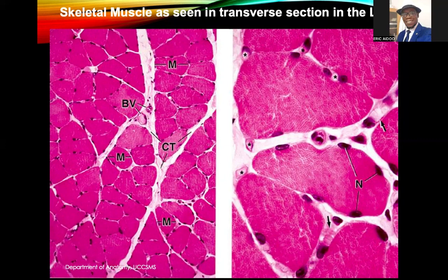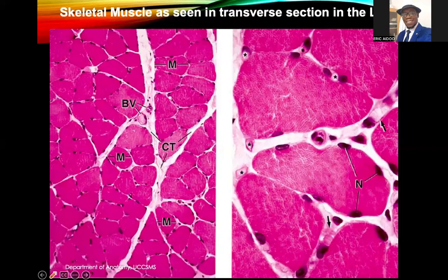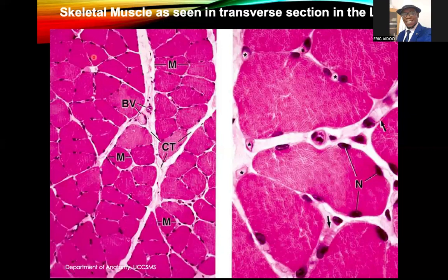If you look at these micrographs, these are actually transverse sections. You can see that they are in profiles. So you have this profile, another one, another one, that's another one. So all these are muscle fibers enclosed by an endomysium.